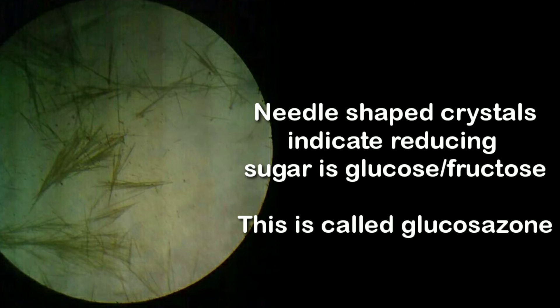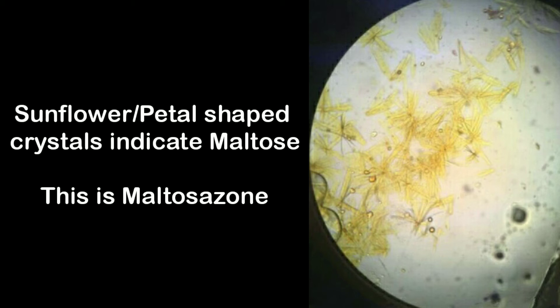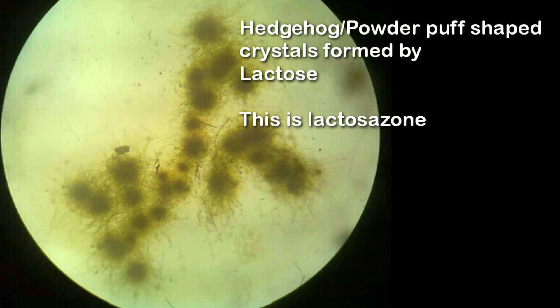The following are the images which I captured using my microscope. The needle-shaped crystals indicate the reducing sugar is glucose or fructose. In the next figure you see sunflower or petal-shaped crystals indicating the presence of maltose. And the last figure is lactose forming hedgehog or powder puff shaped crystals.